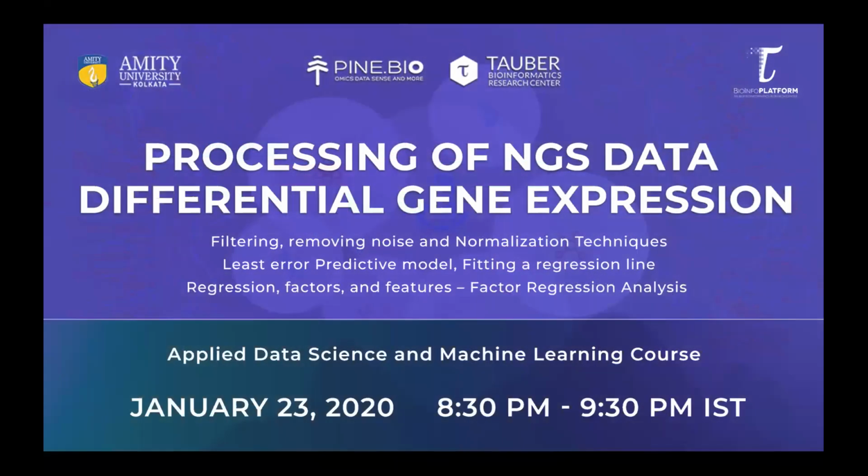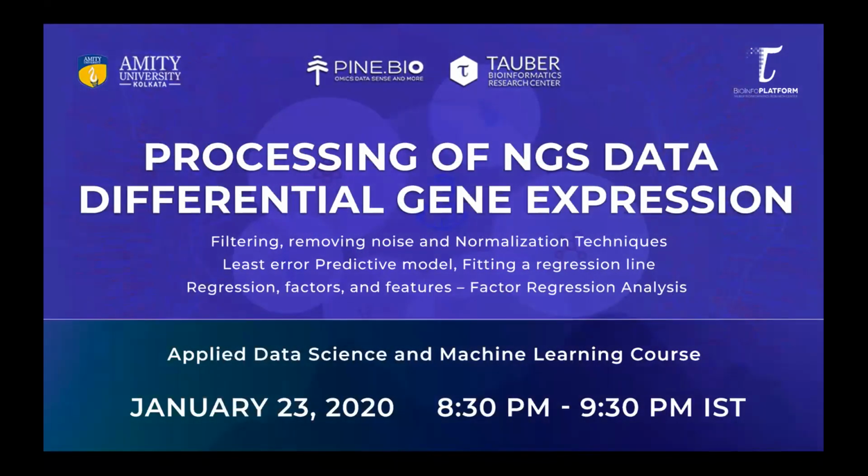So today, as a result of running the RNA-seq pipeline, we get a table of expression, and today we are going to talk about the table of expression. In this session, we will talk about approaches that are important for working with our table of expression and preparing it for downstream analysis. As I was telling you before, we will be talking about transformation, normalization, PCA, and regression in general, and we'll be elaborating more on it in the next class as well.